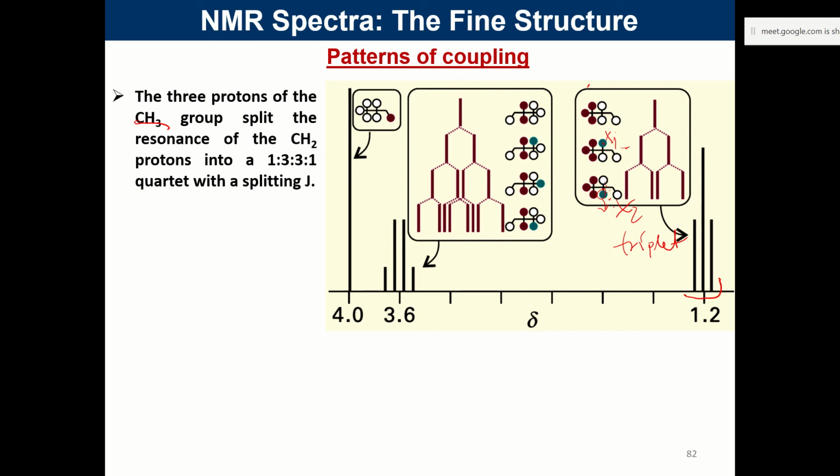Now a similar concept you apply to the other counterpart. This time you see the maroon part, the brown part that you see, this is CH2, this is taken as one unit, CH2, the methylene protons. Now they interact with each of these methyl groups, X1, X2, X3 system.